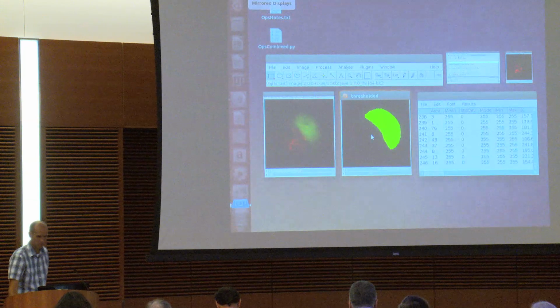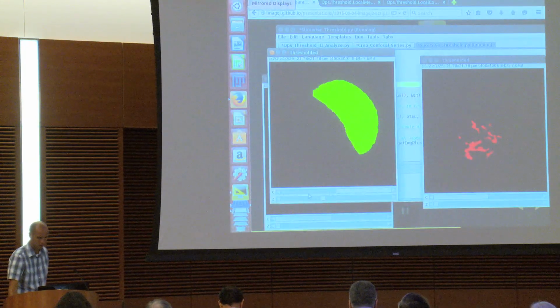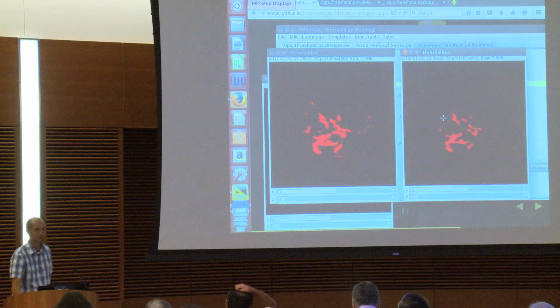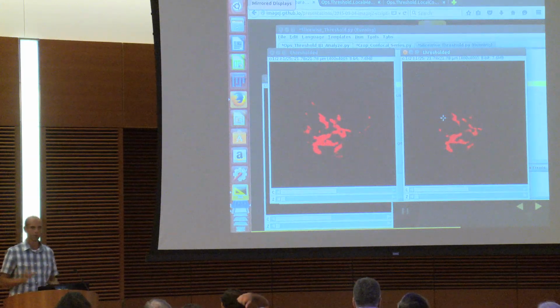So now we have 2 results. This is the first one. And here's the second. And we're looking at the first slice of each, and they're a little different. Does anybody know why they're different and sort of what happened?